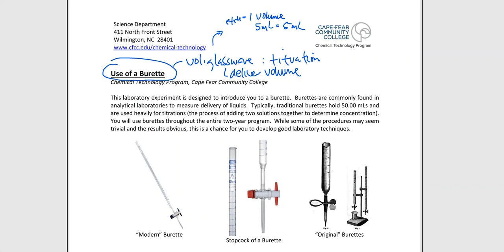I mean, this is something that is not going to be a problem most of the time in routine laboratory work, as long as I know how to use the tool. Oh God, I'm getting so excited. I'm getting choked up just thinking about it.